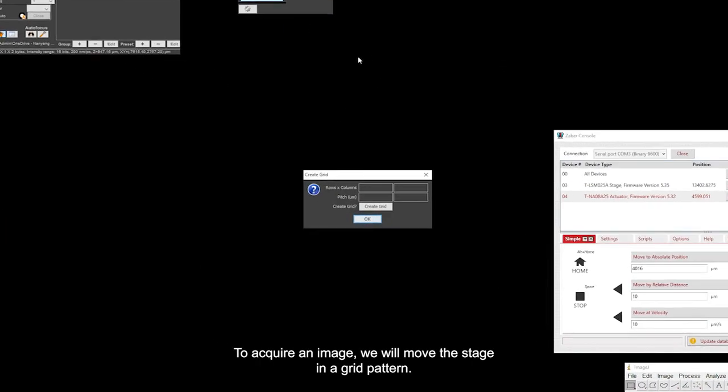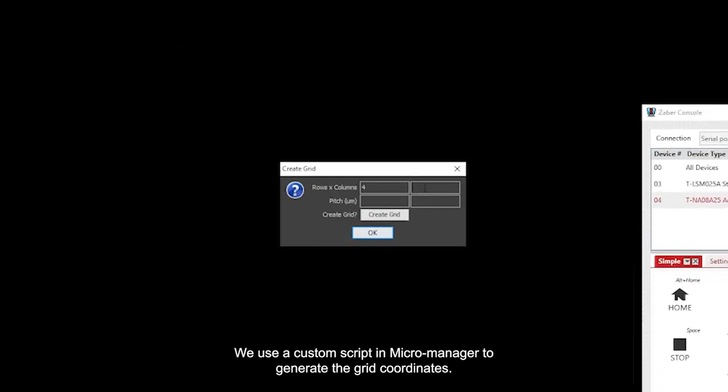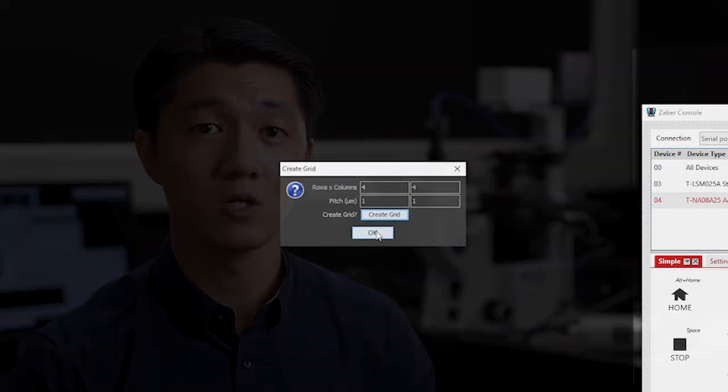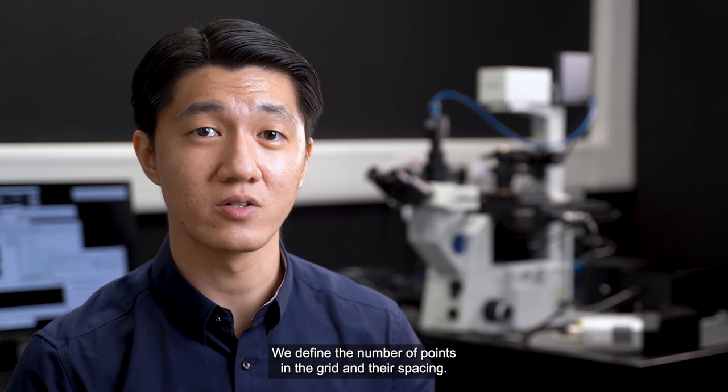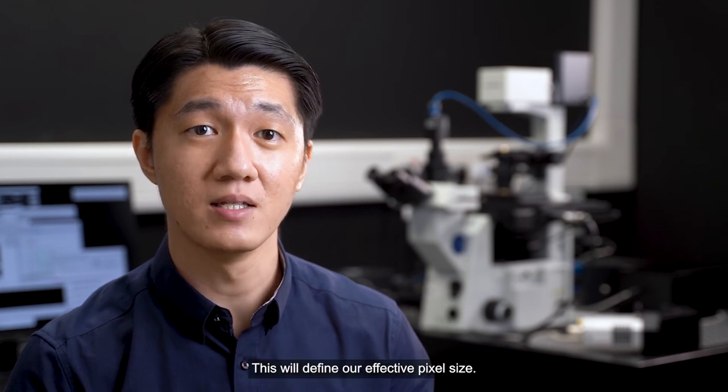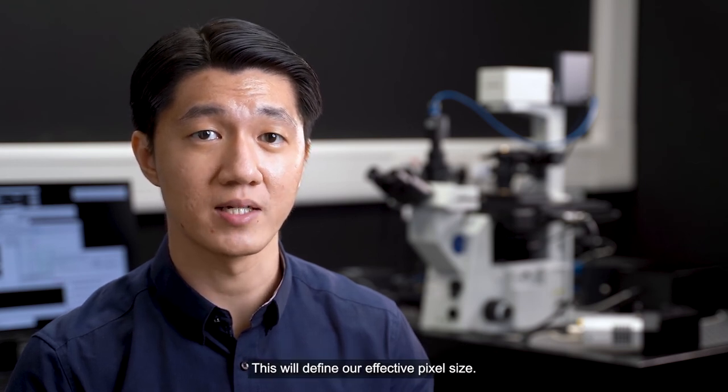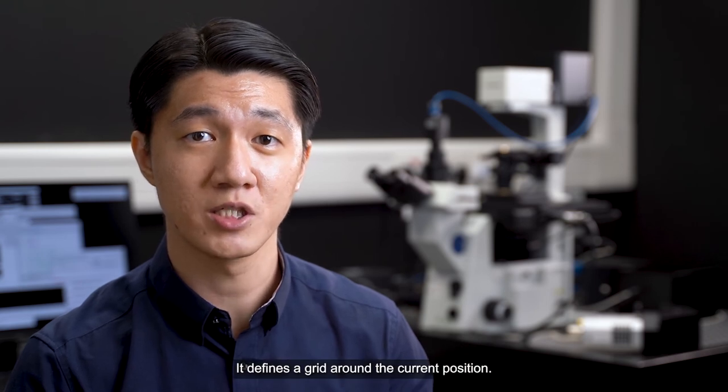To acquire an image, we will move the stage in a grid pattern. We use a custom script in MicroManager to generate the grid coordinates. We define the number of points in the grid and their spacing. This will define our effective pixel size. It defines a grid around the current position.